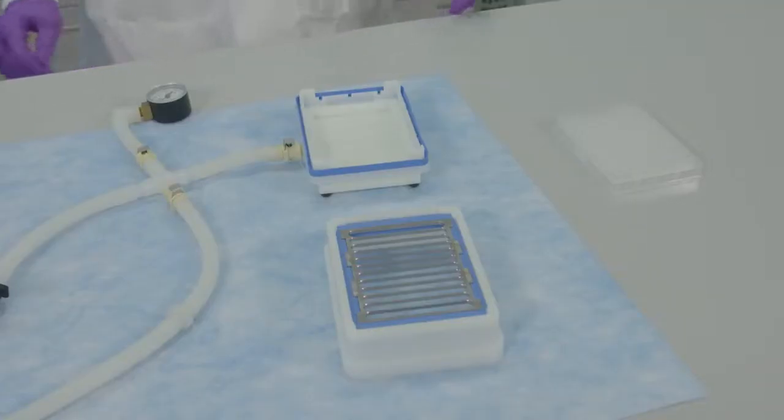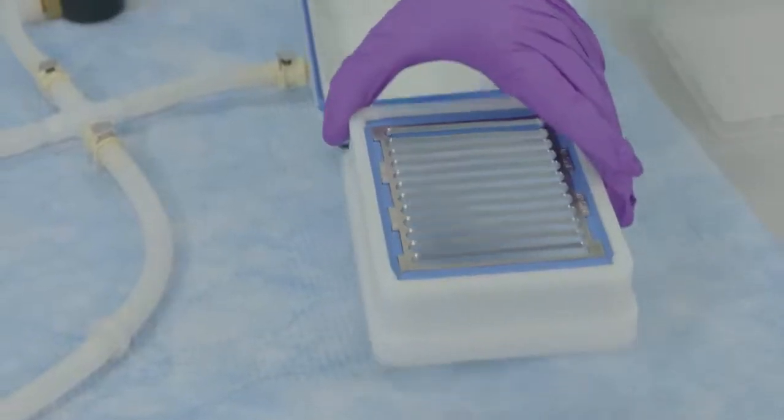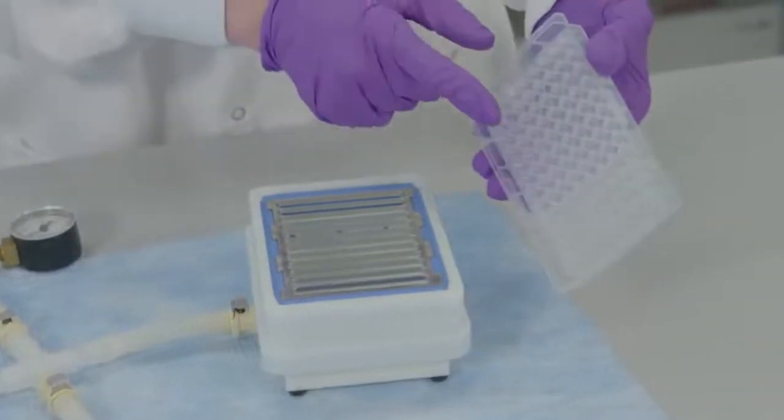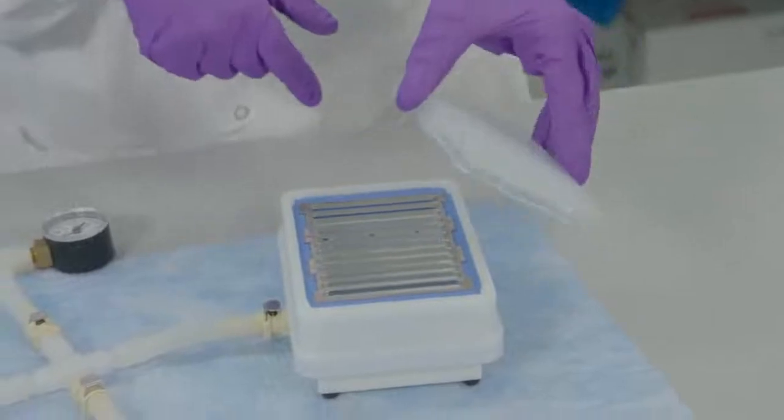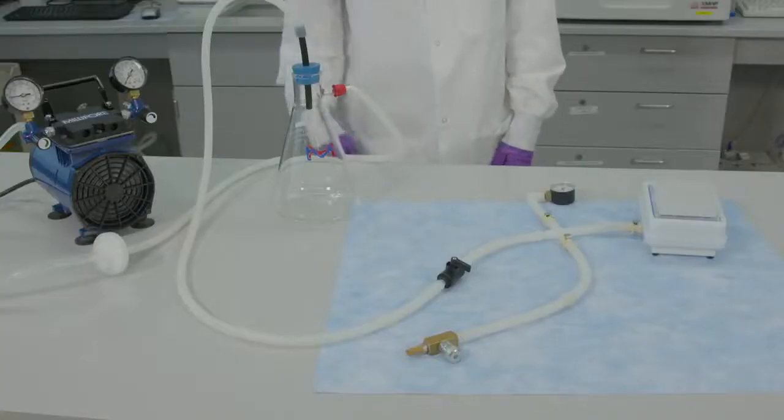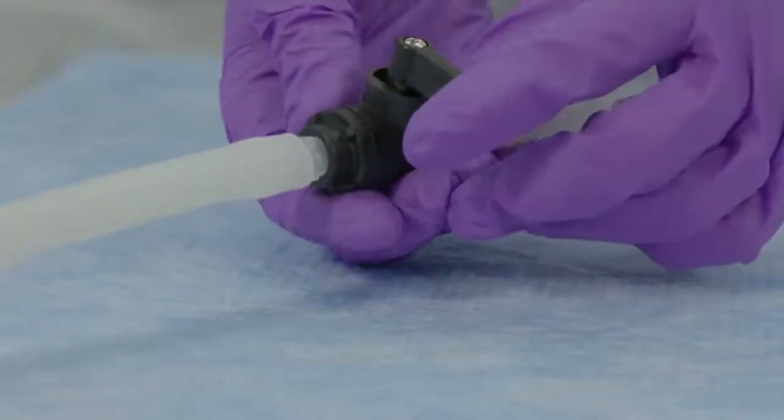Put the manifold collar on the base and then put a standard solid bottom collection plate on the manifold collar. Turn the on off valve to the open position.